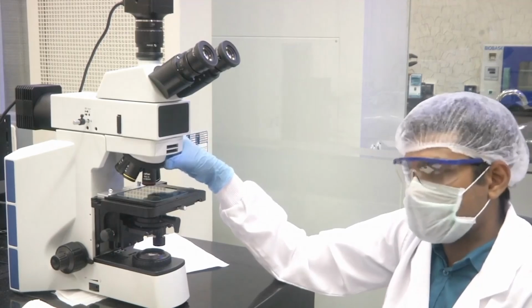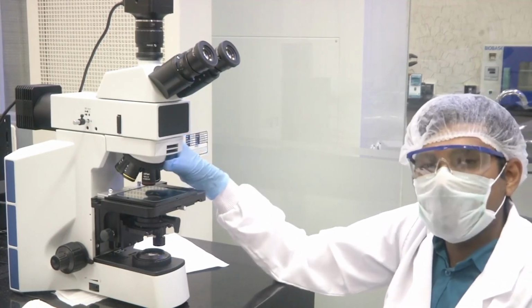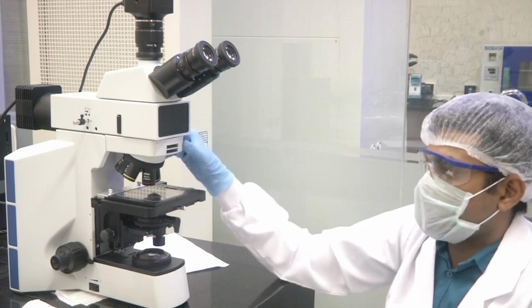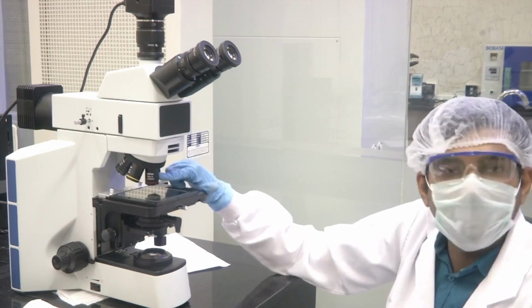Here in this microscope, or in any standard metallurgical microscope, the turret provides for having multiple objectives connected to your eyepiece. So the eyepiece is fixed with 10x magnification. So let us see. You see there is a red band here. This is one eyepiece, one objective.